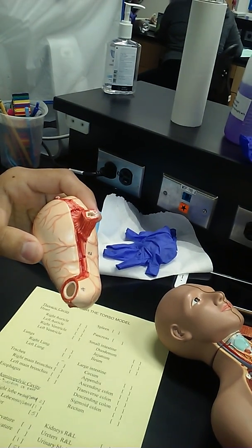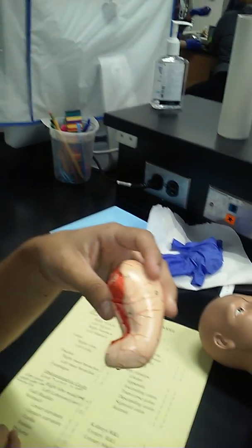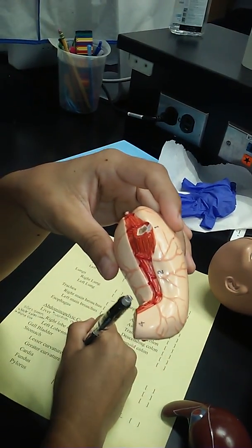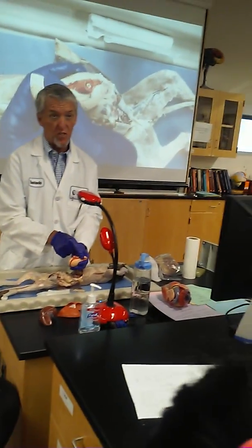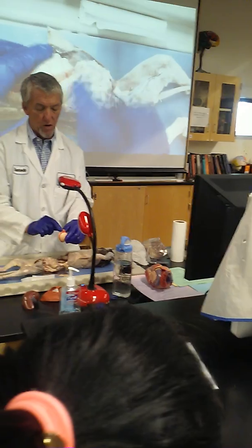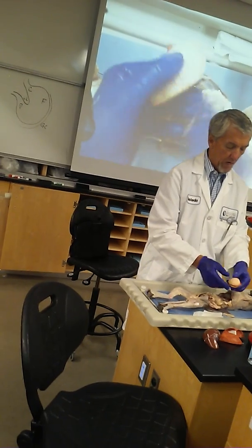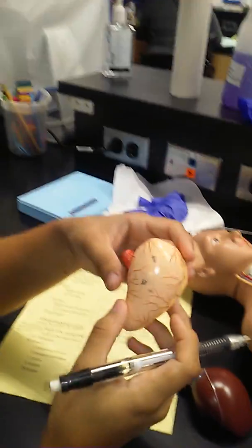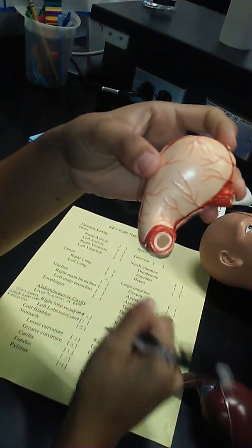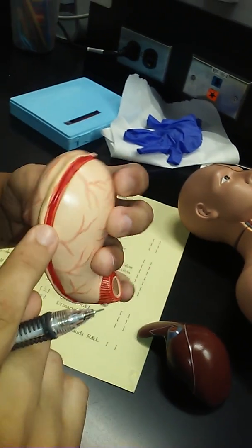The stomach has two curvatures. There's a lesser curvature here with the number 2 on it. How do I tell it's lesser? Well, think about the distance from the entrance to the exit. If I travel this curve of the stomach, it's a very short distance, isn't it? What if I travel 180 degrees from that? What if I travel across the fundus, down underneath, and all the way around, and finally get over here to the exit? That's a long distance, isn't it? It's got the number 3 on it. So the lesser curvature of the stomach and the greater curvature of the stomach are two other important landmarks here.